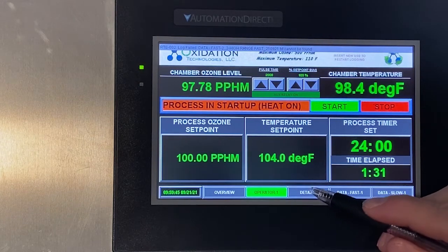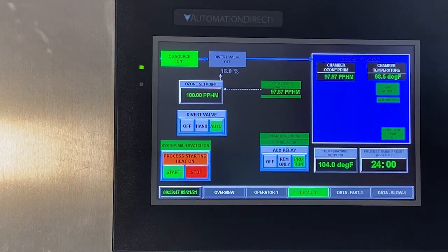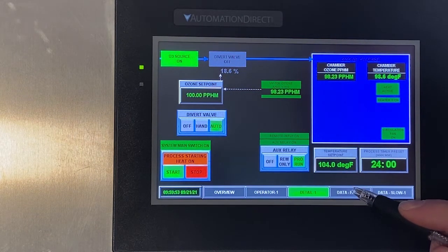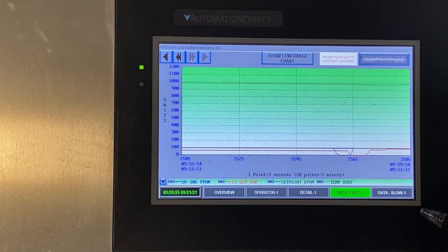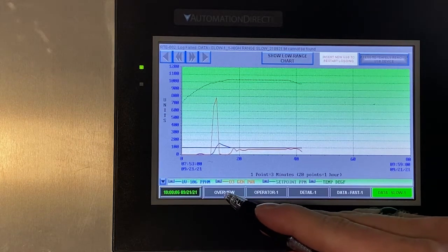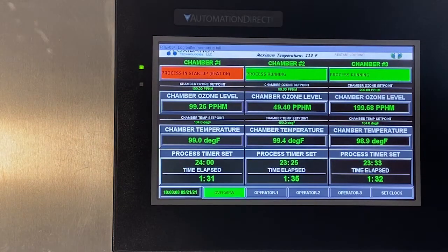There is a detail screen that shows more specifically what is going on with the machine as it's running. The next two screens show the data. This is a real-time trend screen for the ozone and temperature levels throughout the test. The overview screen displays each chamber's operation all on one screen.